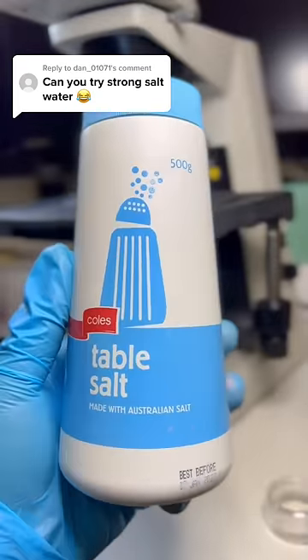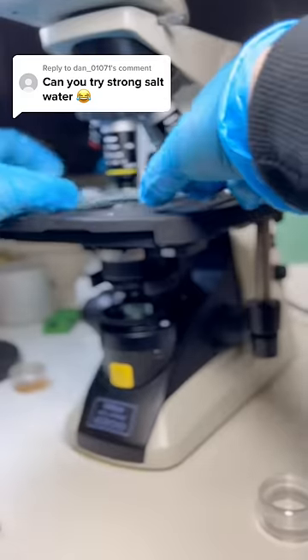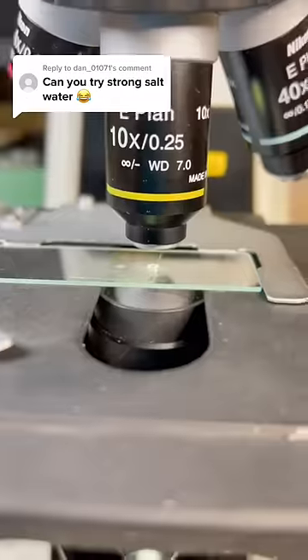Salt versus bacteria under the microscope. This is a bacteria sample of rotting food and water. Let's look at it before any salt is added.